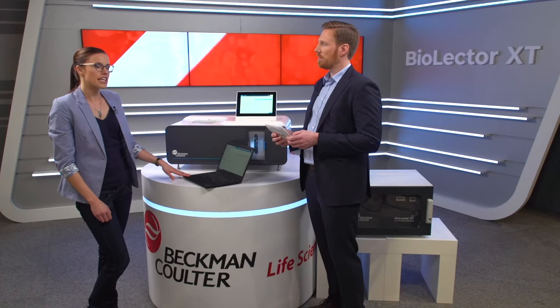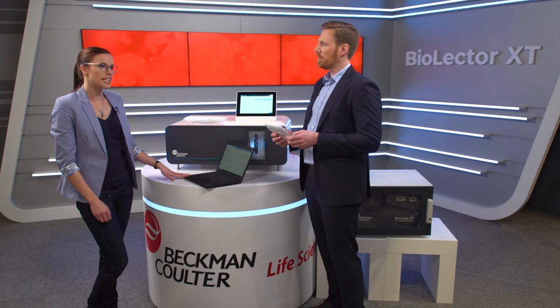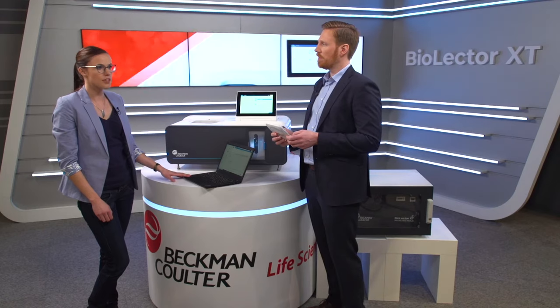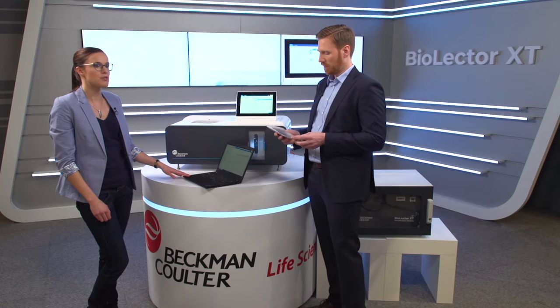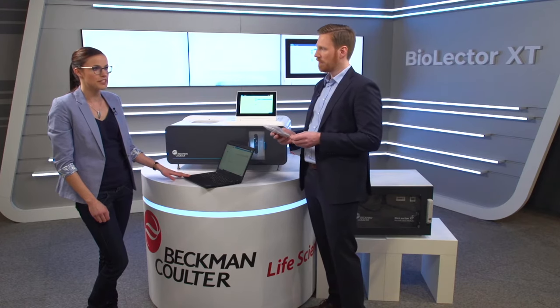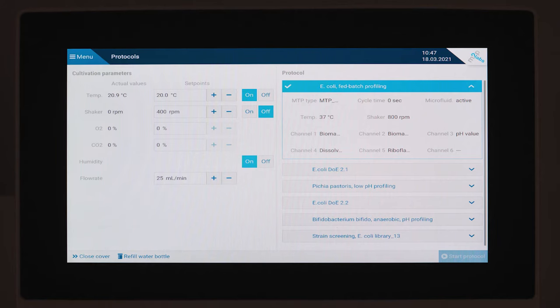Here you can choose any kind of gassing mode, such as atmospheric air, anaerobic mode, CO2 upregulation, O2 downregulation, or O2 upregulation, with constant or variable flow rates between 5 and 50 milliliters per minute. If you look at the BioLector XT screen, you can see the actual values of ambient conditions of the running experiment.